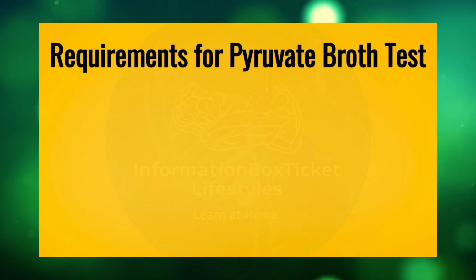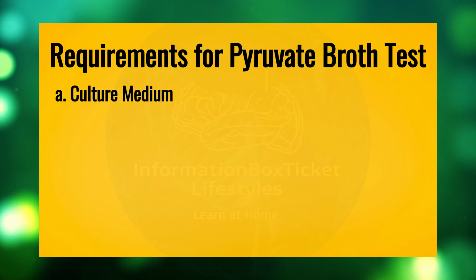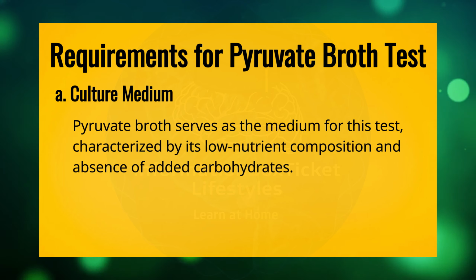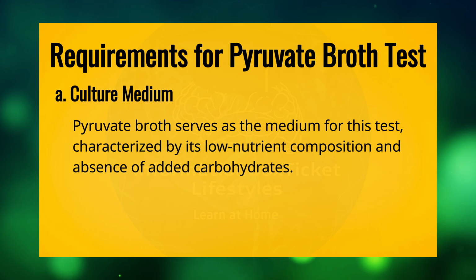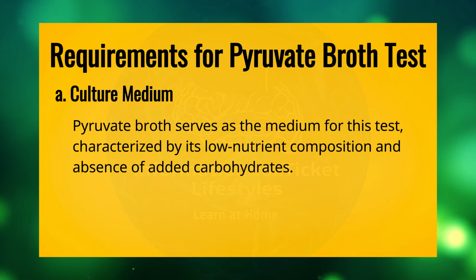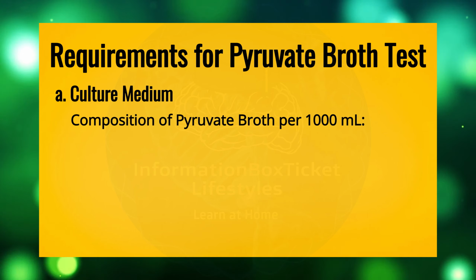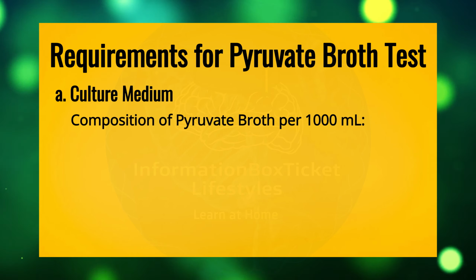Requirements for Pyruvate Broth Test. Number 1. Culture medium. Pyruvate broth serves as the medium for this test, characterized by its low nutrient composition and absence of added carbohydrates. Composition of pyruvate broth per 1,000 ml.